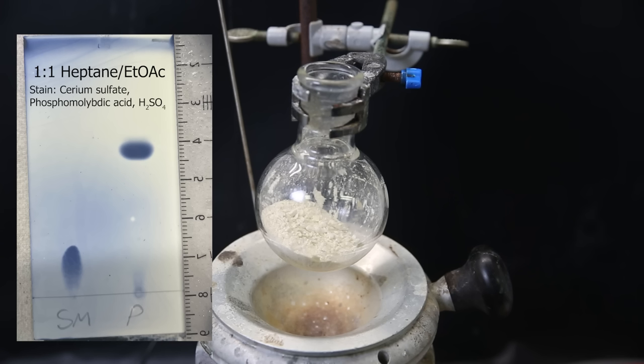I also ran a TLC on the product compared to the starting material, which will show the compounds that are present with a spot on the plate. We see that the starting material doesn't show up in the product, which means that it is completely consumed. Whatever stays behind at the start of the product is just some polar impurity or N-hydroxyphthalimide, which I forgot to check, but it doesn't matter. We then also see a perfect spot of the product which aligns with the literature. There might also be some non-polar impurities that are in the solvent front, but I can't tell since it will pretty much always stain the whole solvent front anyway.